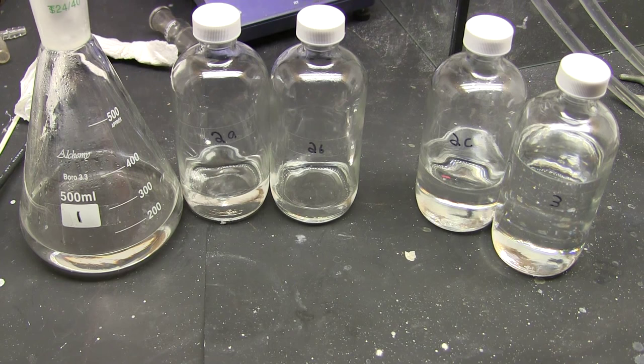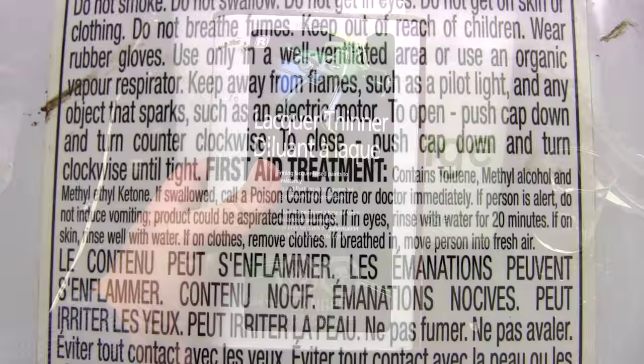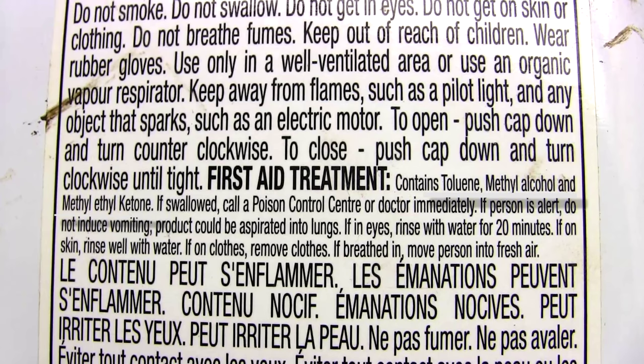Greetings fellow nerds. I need some toluene for my lab and in the past I was able to buy it directly as paint thinner. But now I can't find a purer source and all I could get was this lacquer thinner that claims to contain toluene mixed with methanol and methyl ethyl ketone.